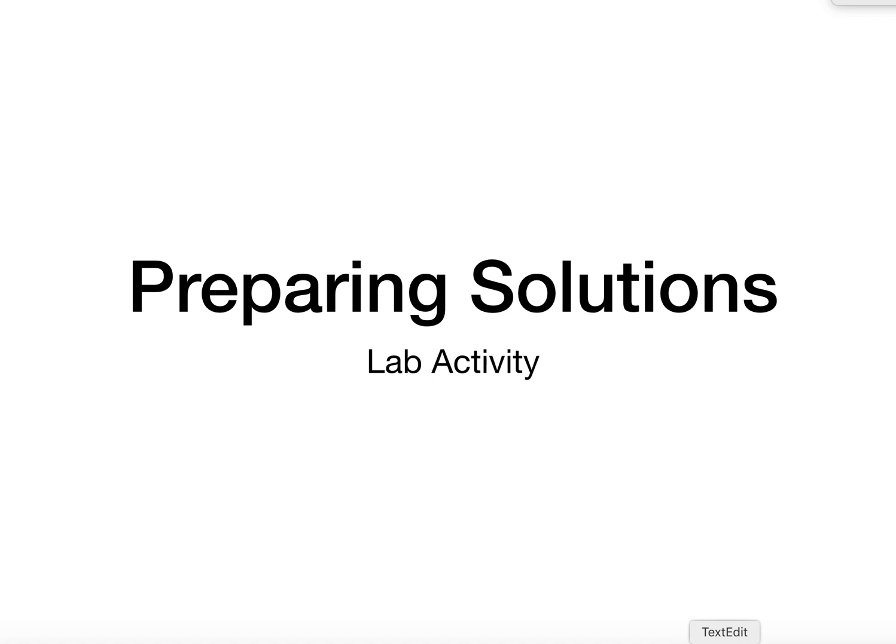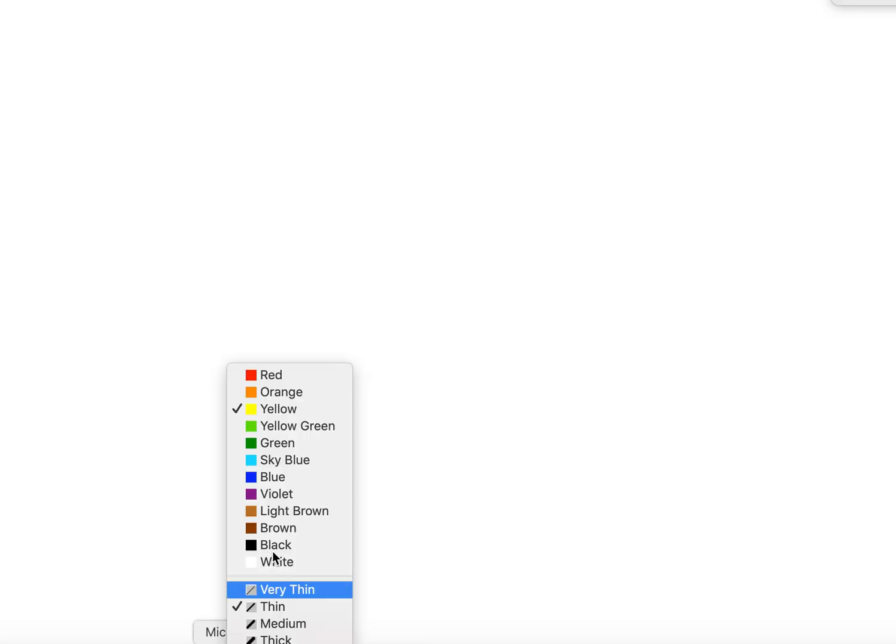Good afternoon, class. We're going to take a little different route with our video today, and we're actually going to do a sample lab. We're going to prepare some solutions. You're going to have to answer some questions with that. So I'll give us some background information on this.